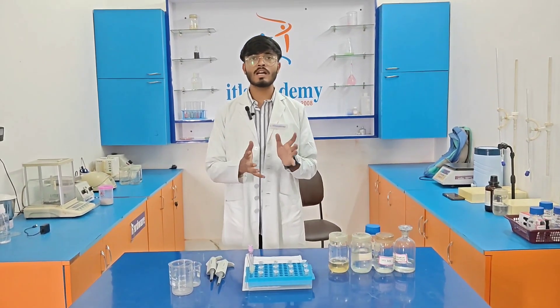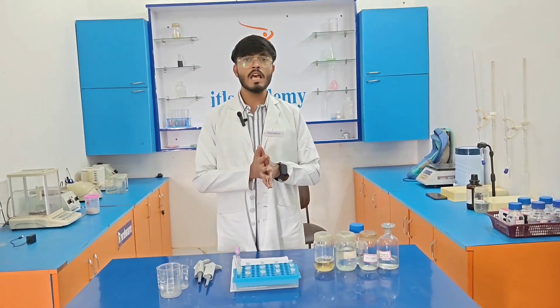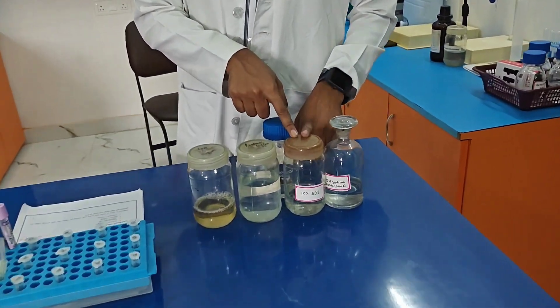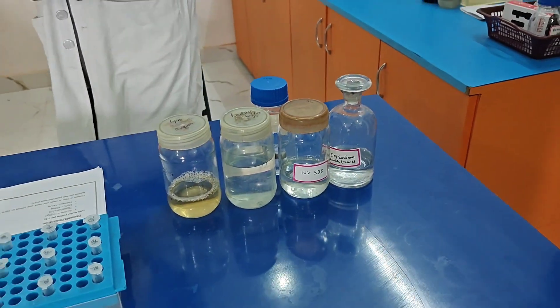Before we start this experiment, we need a few buffer solutions. The very first is lysis buffer, second is protease buffer, third is 10% SDS solution, and fourth is 5 molar NaCl solution.